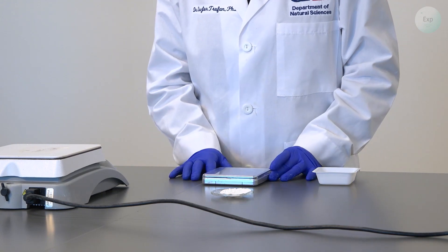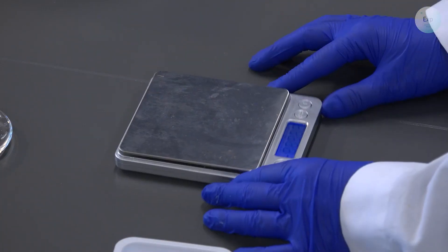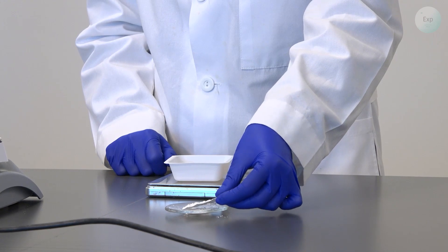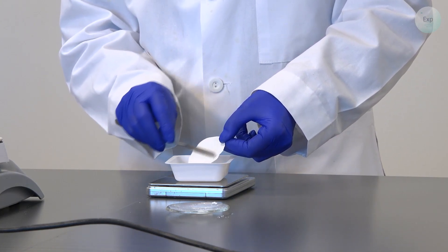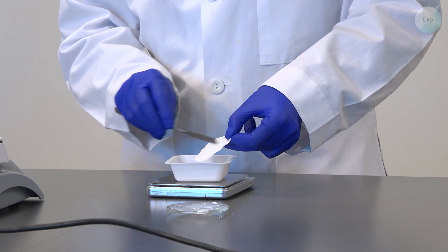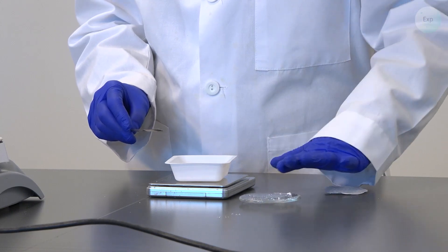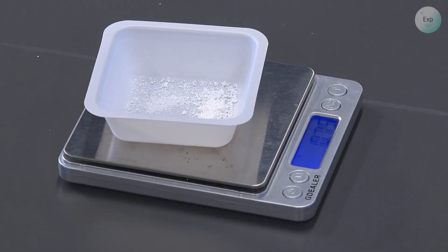For the final step in the process, we will need to measure the mass of the calcium hydroxide that we recovered. So we're going to take our scale, turn it on, place our weighing boat on top and tare it. Then we extract our filter paper with the calcium hydroxide on top and gently scrape off the calcium hydroxide. The gentle scraping will help remove the calcium hydroxide but will not facilitate the removal of cellulose, which is our filter paper. We also transfer any calcium hydroxide remaining on our watch glass. What we find is that we recovered 0.75 grams of calcium hydroxide.